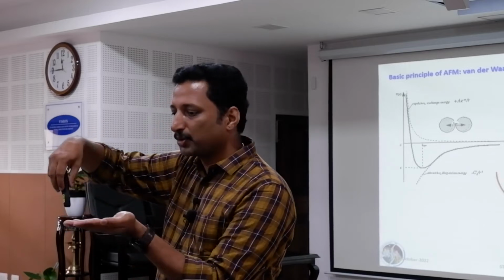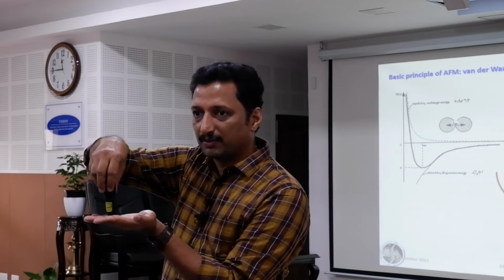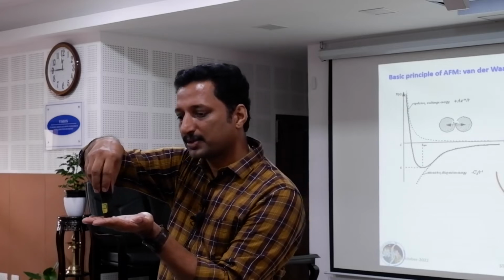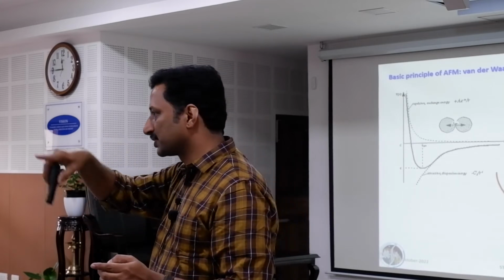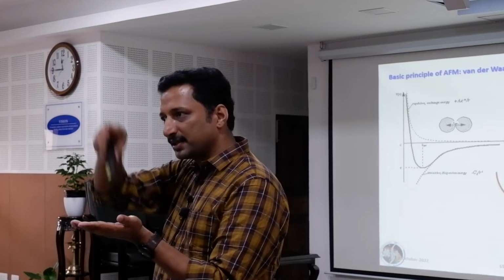Contact mode means we are actually coming down and touching the sample, and we know that the tip is in contact with the surface. Then we are slowly, very softly patting on the surface basically, with the tip. And then we know what the surface features are, because every deflection gives you a pixel, so we can map it.